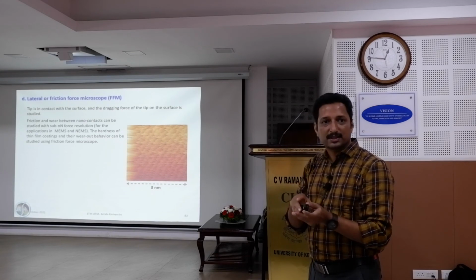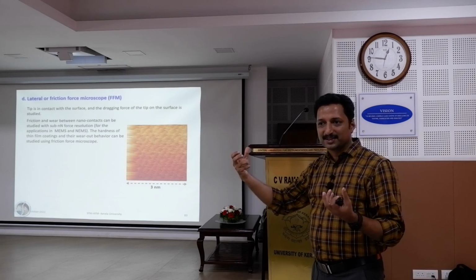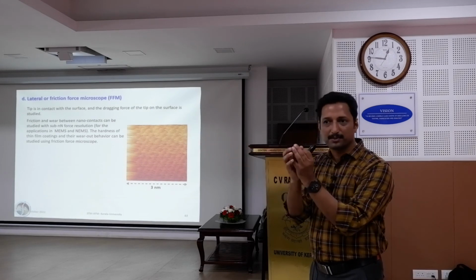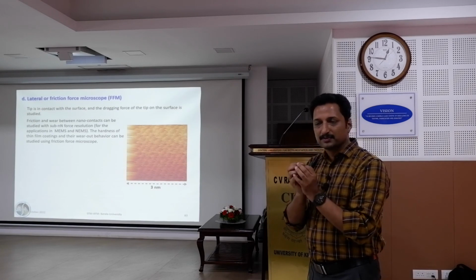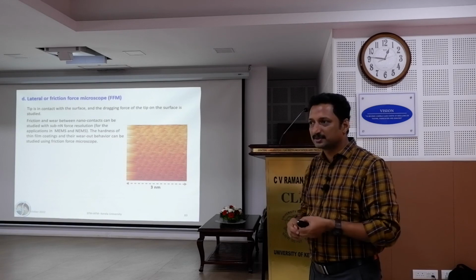How much force is taken to unfold it? How can we measure it? Okay, so one protein is there. If I heat it, it curls up and becomes a bundle. I just want to reopen it and see how much force it took to curl it back.